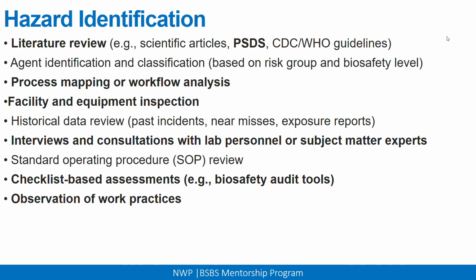Observation of work practices. Sometimes all you need to do is observe the practice of people. So you may have a biosafety cabinet, and the easiest way is just to observe how people are using it. Are they putting on PPE while using the biosafety cabinet? Are they making sure that they switch on all the switches on the cabinet?